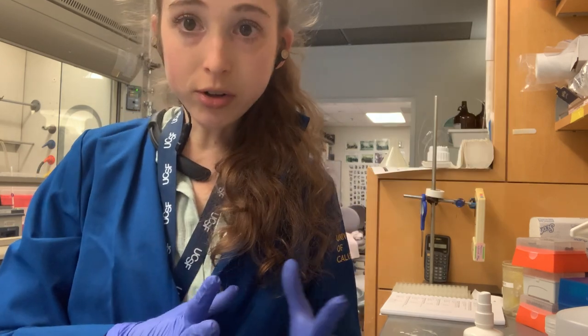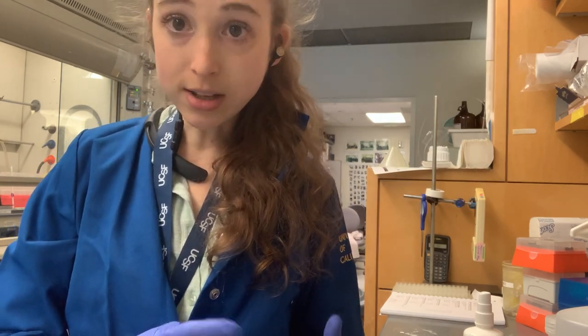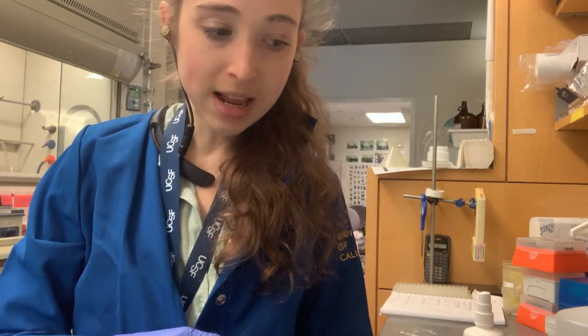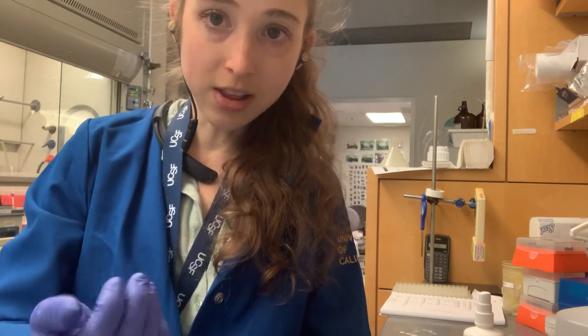For the labeling, try to label your things before you actually stick stuff in them. Say you have a solution that needs to be kept on ice, or maybe you're aliquoting an enzyme into a bunch of tubes — label the tubes first.